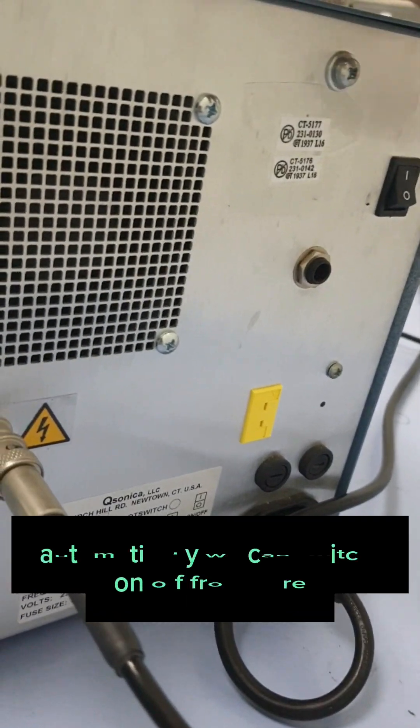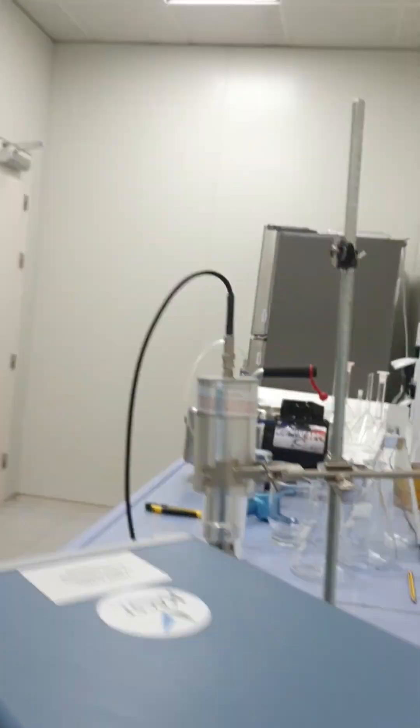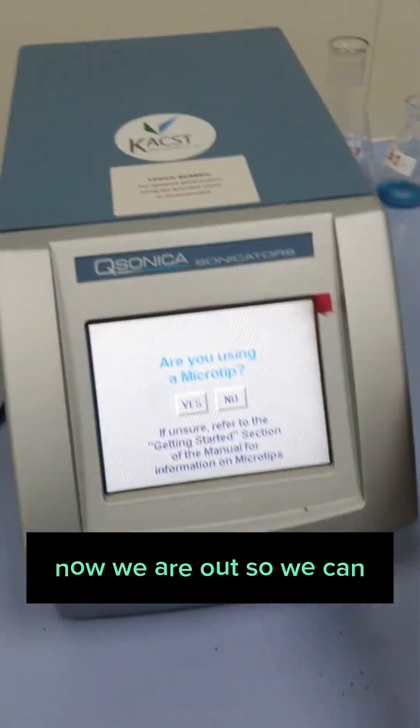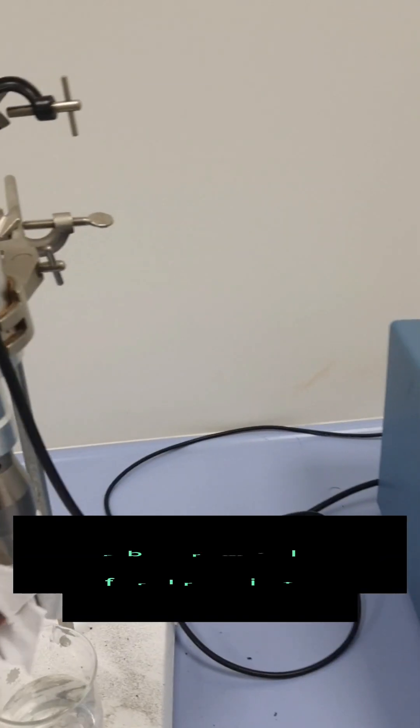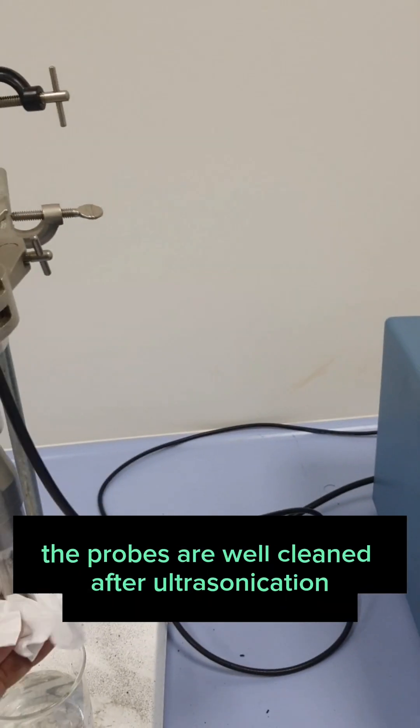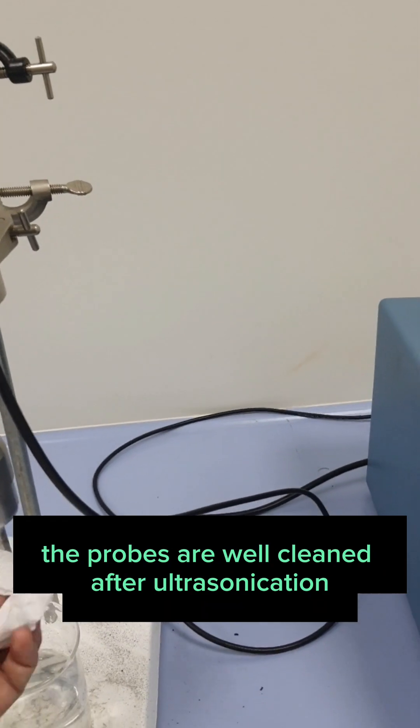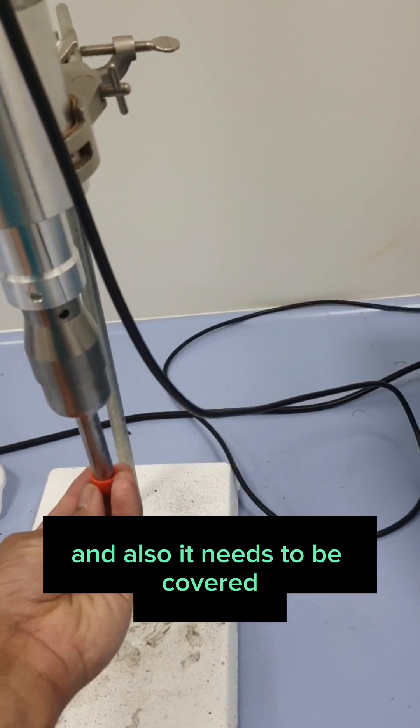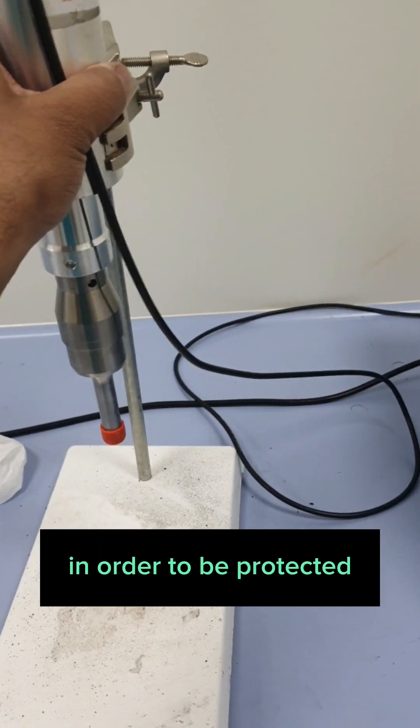Automatically we can switch on, off from here. Usually doing that, we will exit this one. Now we are out. So we can close. The probes are well cleaned after ultrasonication. And also, it needs to be covered in order to be protected.